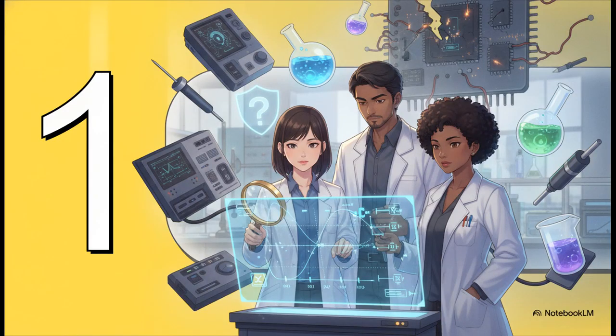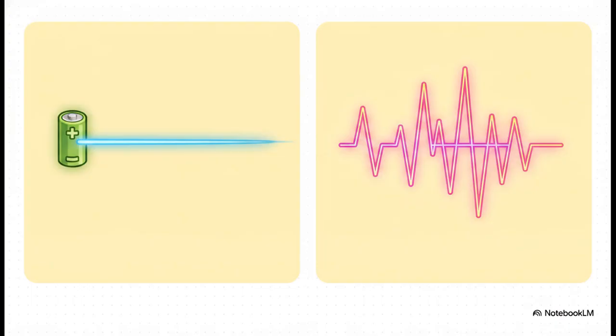Section 1. The Electrochemical Detective. To solve this case, let's first look at the analytical tools we have at our disposal and why our traditional, old-school methods completely fall short when things get complicated. Let's dive in by comparing two really fundamental concepts. We all know standard DC, or direct current resistance, from Ohm's law, right? It's simple, it doesn't care about frequency, and it assumes perfectly ideal conditions. Think of DC resistance like just pushing continuously against the solid wall to see if it moves. But we know the real world is messy. Real-world electrochemical systems exhibit incredibly complex behaviors that force us to abandon that simple concept.